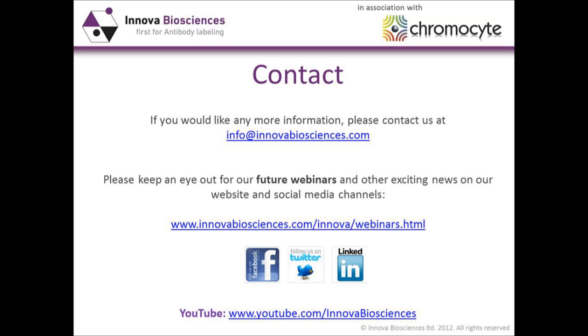The main advantage is that direct labeling is indeed a much cleaner technique, and you can get results at least as good with direct labeling as you can with secondary reagents. Again, on the Innova website, there are some examples doing a comparison of direct and indirect antibody labeling, which show just that.